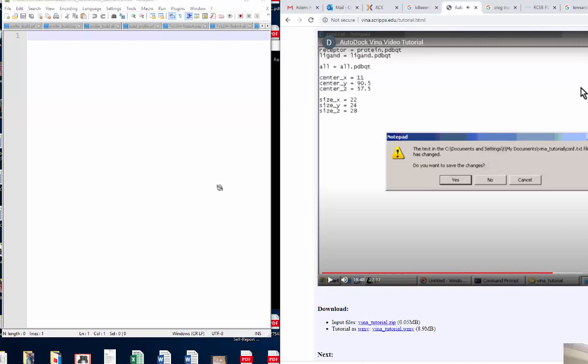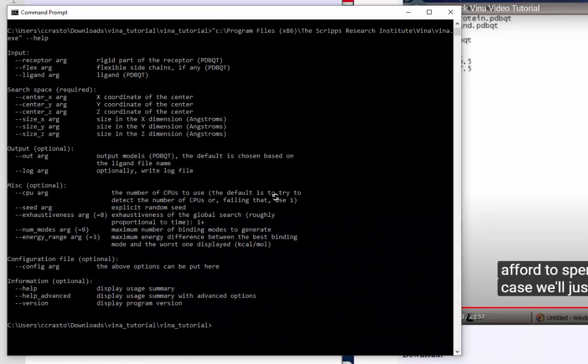Okay, I'm going to stop the video just temporarily because I wanted to explain now. I don't know if you are following, but if you cannot hear what he's trying to say, let me pull one back. If you ask where all this stuff is coming from, it's coming from here. All these choices, see center X followed by what's called arg. And arg in this case is whatever information you want to put. That's called the argument, right? So center, size, receptor, the flex, the ligand, etc.